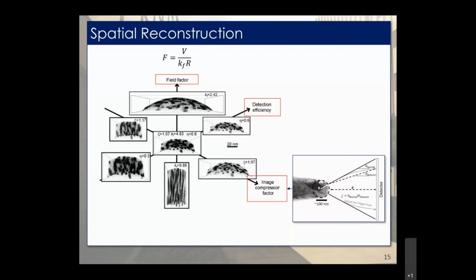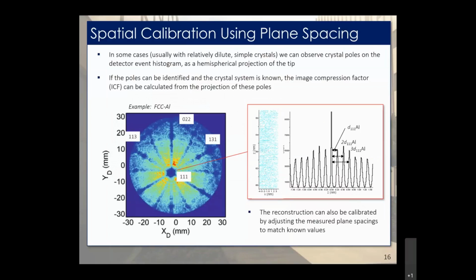And as part of building that trust in terms of spatial calibration, there are other pieces of information we can bring in. I already talked about bringing in a TEM or SEM image to help build profiles on the specimen. You can also take some information from other aspects of the atom probe data.